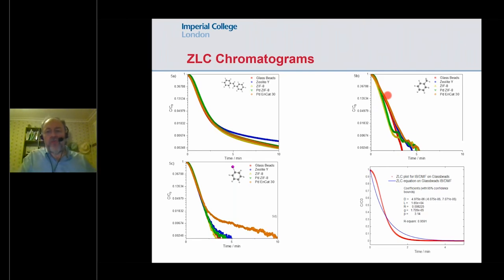It's also a very small molecule, so if it does go in the pores, it will diffuse out quite quickly. So in this case, we've got fairly clean diffusion and no strong interactions. We're particularly interested in these lines, because as you'll see in a moment, some of them don't do this. And this is a log scale, by the way. So although you might say it's not linear, this is a log scale, so the concentration has dropped by a lot. By the time it gets down here, we're at 0.1% of the starting concentration.